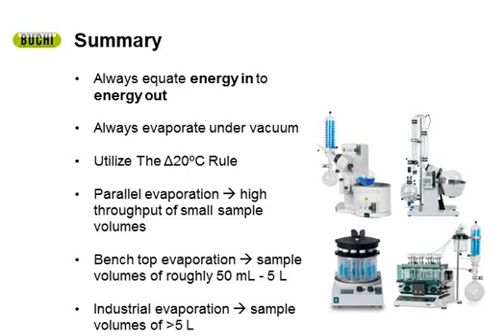Okay, so your best bet: an industrial scale has a wider flange. I think it's 150 millimeters. So it's easier to get it out of an industrial flask than a benchtop flask. You shouldn't have too much problem removing it because that flange is pretty big. We have a device called a suction outlet, which allows you to automatically remove the sample that's in the evaporating flask. That's for a 50-liter evaporating flask. Besides that, the best way is to use a spatula and get it out that way. But our flasks do have a wider flange than most industrial evaporators, so you shouldn't have too much of a problem with a Buchi evaporating flask.